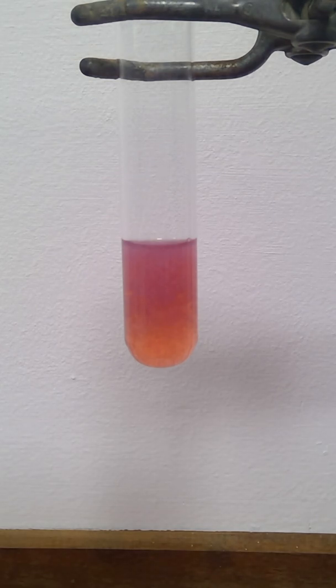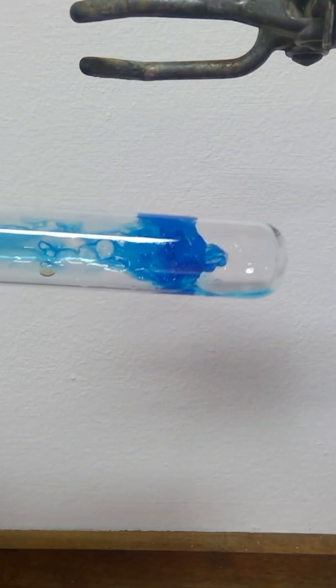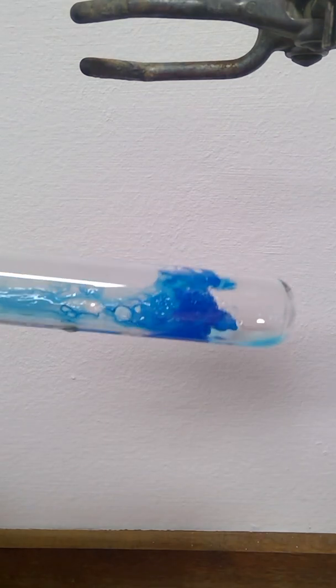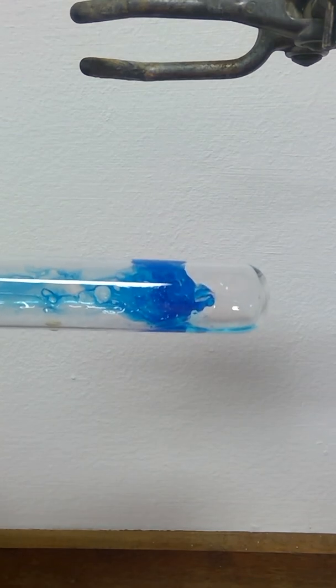Simply to confirm the solid nature of the first experiment, so it is very clear that it is a solid, let's have a look once more at the copper 2 hydroxide formed in the first experiment. And as you'll see, when the solution has been poured away with the spectator ions, it is very clearly a solid material which is left.